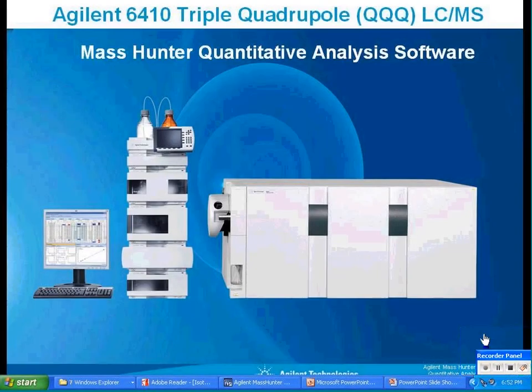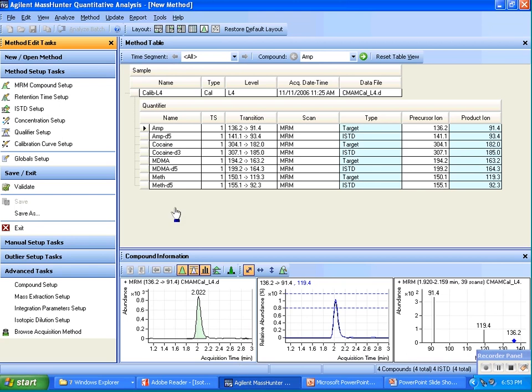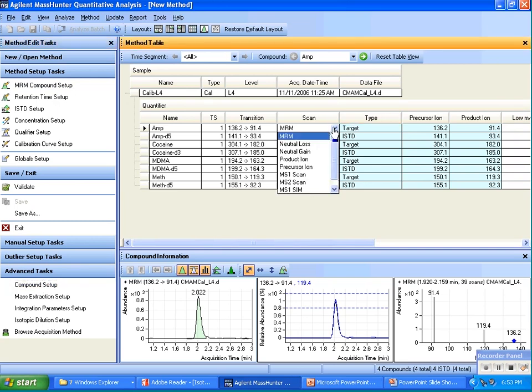the method editor from the point of view of some advanced features. So, as mentioned a number of times, the method editor is oriented toward MRM. And if we drop down into the advanced tasks, we have talked a bit about the other scan modes and creating quantitation methods for those extracted signals. A couple of things I'd like to point out in passing I may have forgotten to mention.